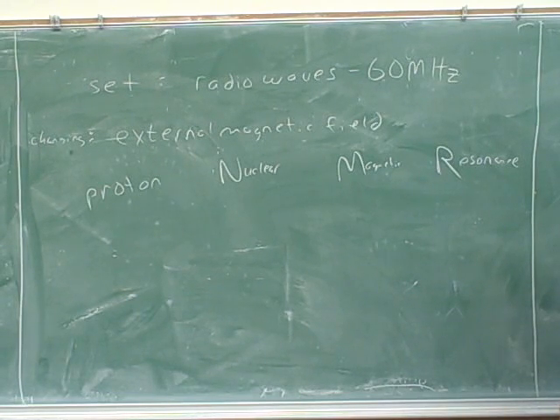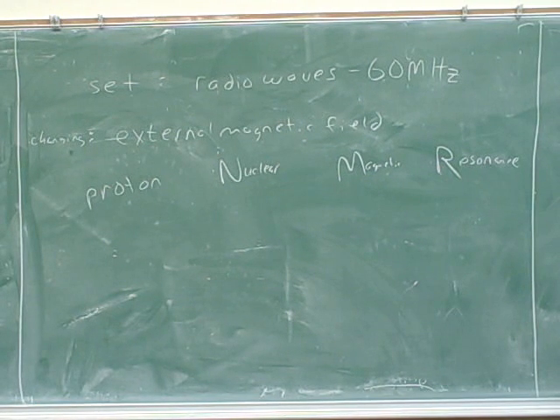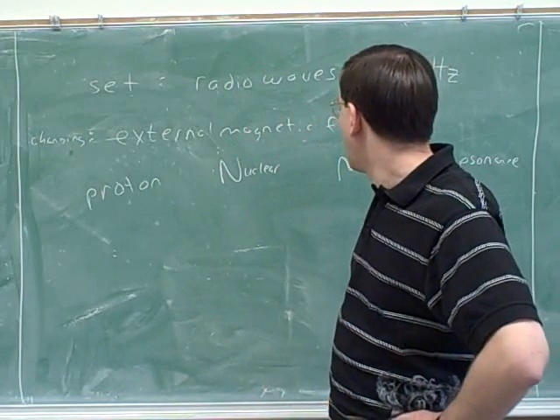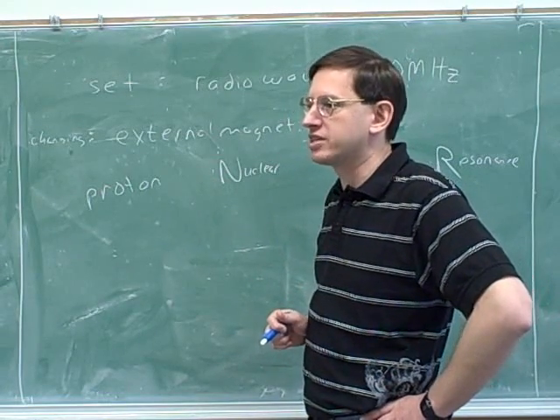I have a question. Is this NMR spectroscopy? This looks like infrared spectroscopy. Yeah, it is. Okay, so that's different. Yeah, there are many different types of spectroscopy. All the different types are ways of trying to get clues about the structure. NMR is one type of spectroscopy, but what you were showing me was a printout for infrared spectroscopy.